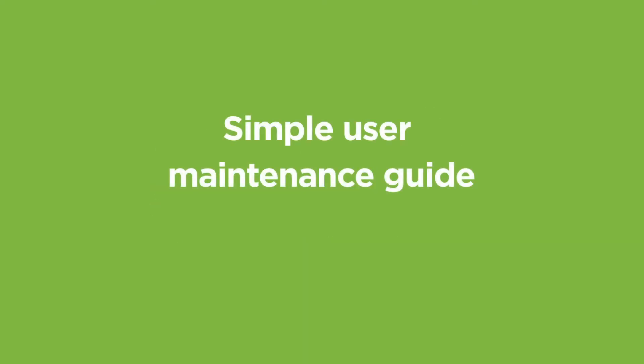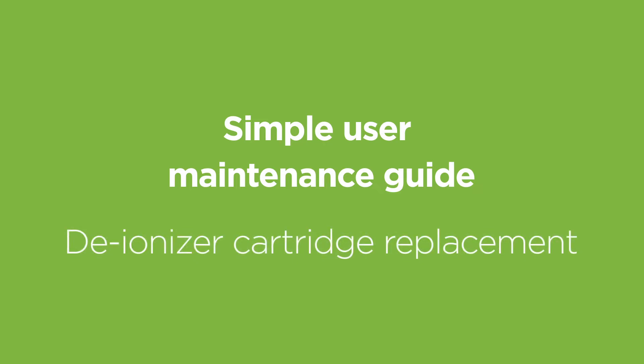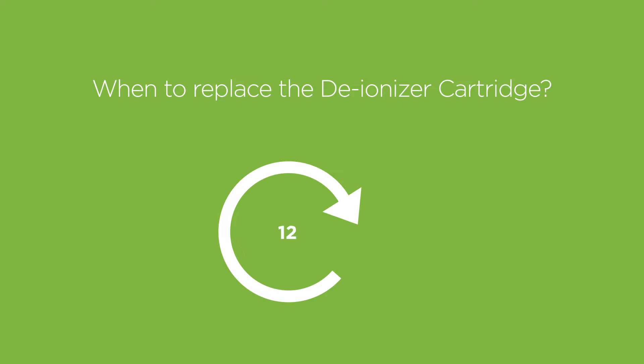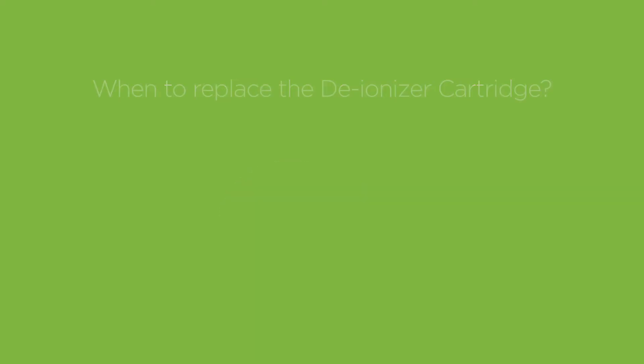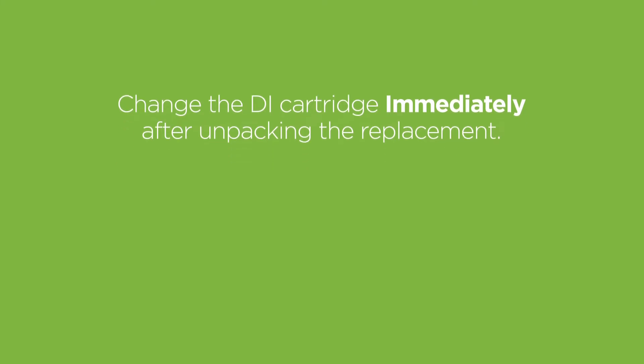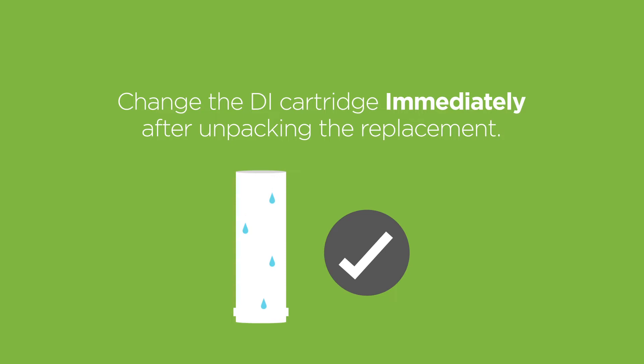Simple user maintenance guide: deionizer cartridge replacement. When to replace: every 12 months from original installation. Please ensure that you change the deionizer DI cartridge as soon as you unpack the replacement.